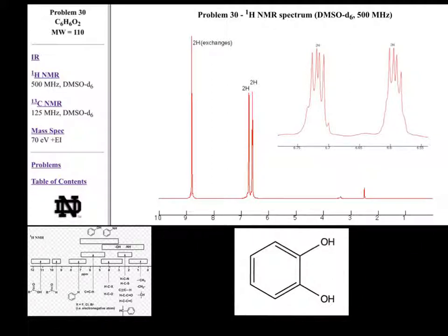Proton NMR gives us a lot of information about hydrogen groups on our molecule. First, we want to note on our spectra that to the right is the lowest number, and that is going to be upfield. All the way to the left, that is known as downfield. Each signal corresponds to a different type of hydrogen group. So on this spectra, we see 3 signals indicating 3 different hydrogen groups that are experiencing different environments.